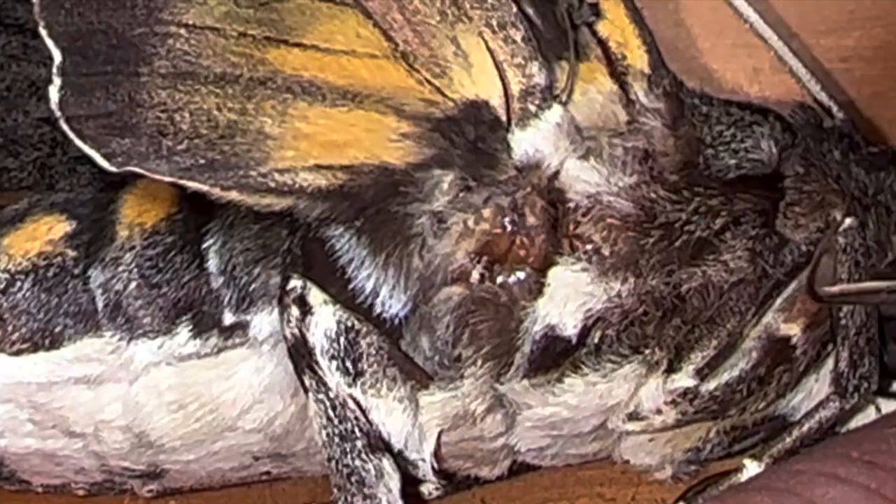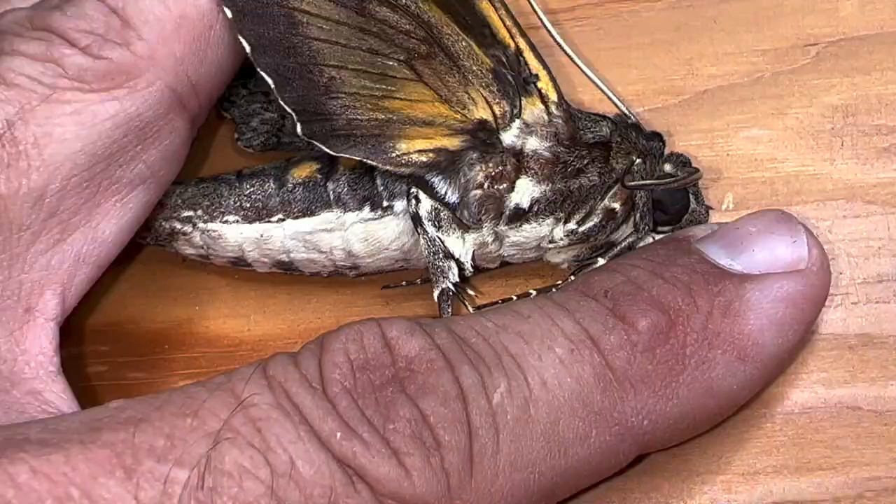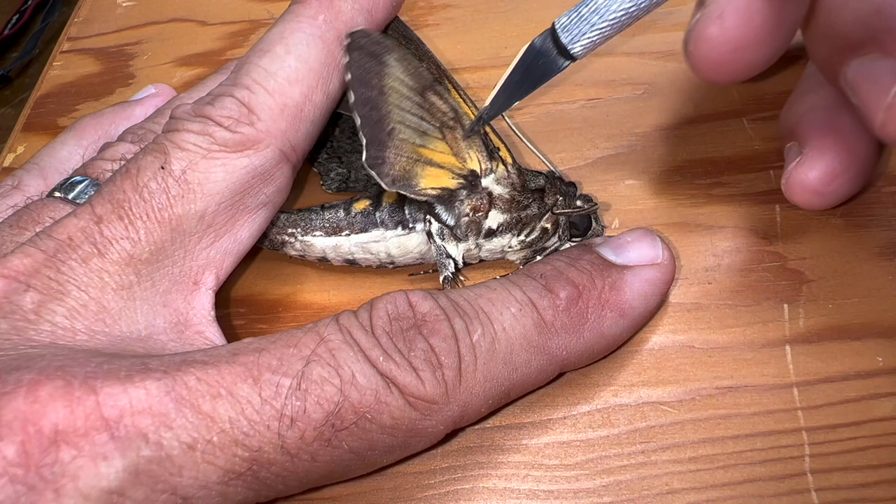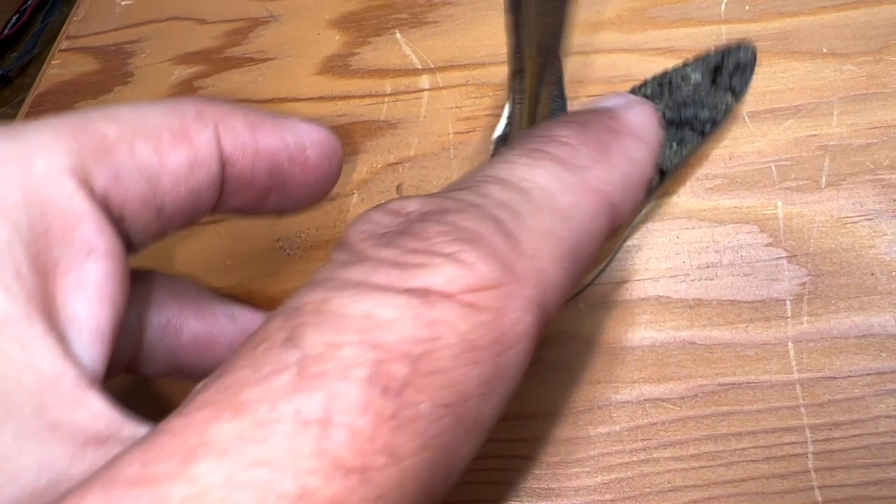You just poke your exacto knife in and sever the tendon. Be careful — you don't want to destroy your specimen. It's very easy to go all the way through; you just want the tip of your exacto knife to sever that tendon. Look how pliable that hind wing is now — it wants to go wherever I put it. This side is done.